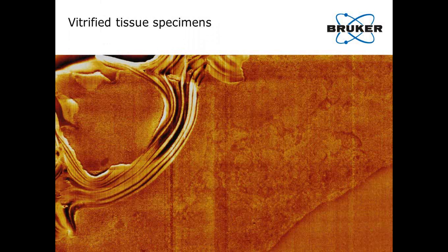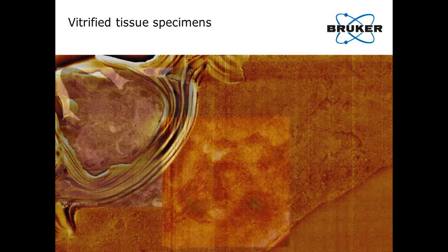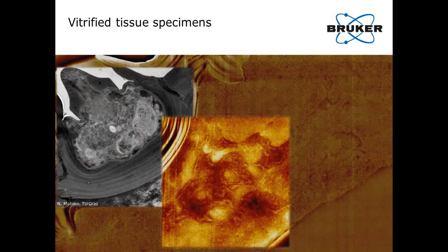Here we see a data zoom of the central region of the previous 25 megapixel image. Appropriate flattening starts to reveal detailed structures in the tissue. When we further compare this region imaged by AFM and the image of an adjacent TEM microtome slice, we see that each shows detail of the cell organelles.